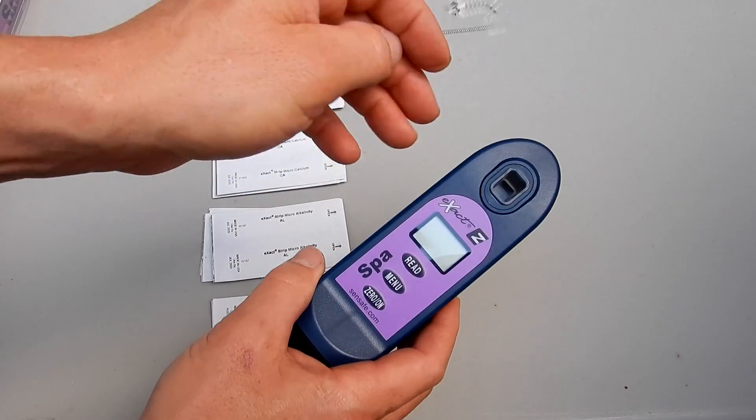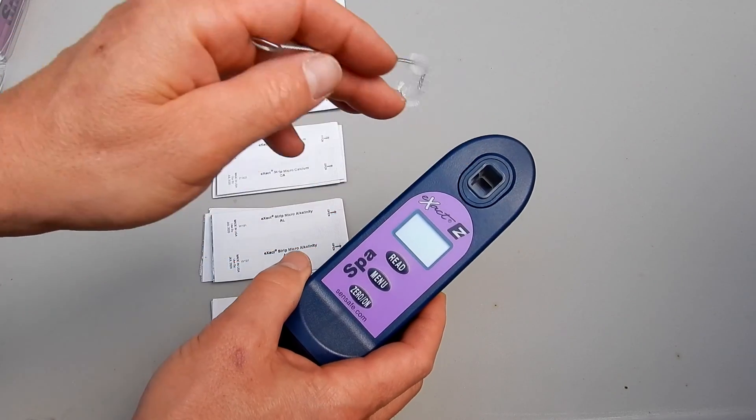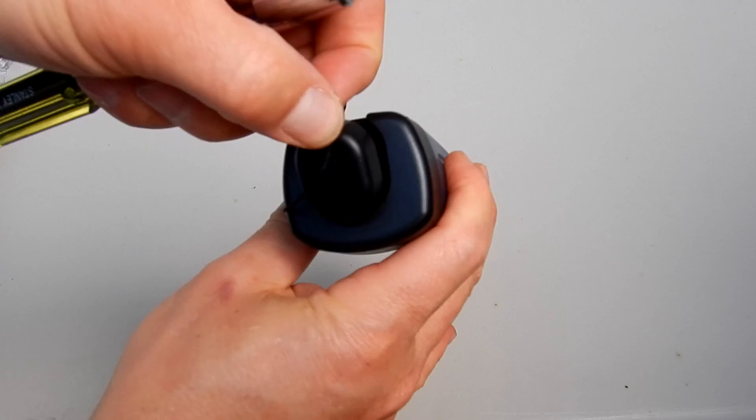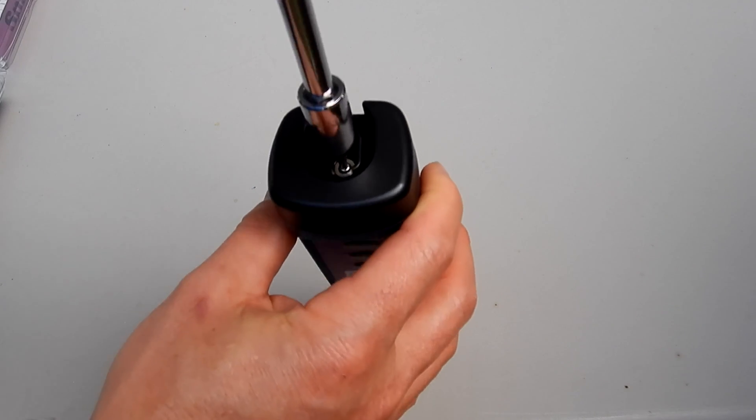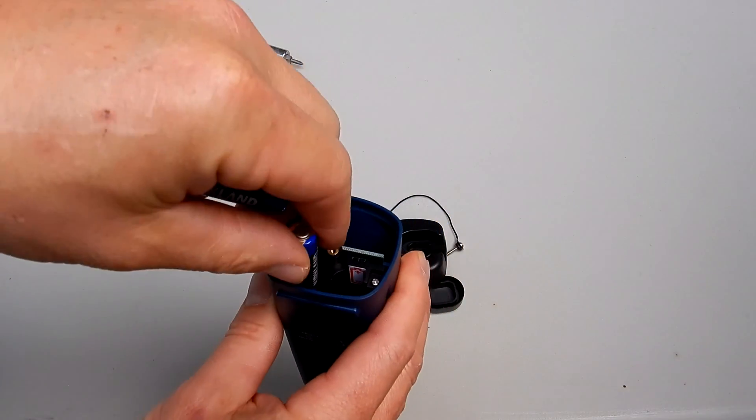Also included is this brush to clean the chamber in between testing. The first thing you want to do is remove the cap here. We're going to remove the screw here holding on the battery compartment and we'll insert the AAA batteries. You'll need four AAA batteries.